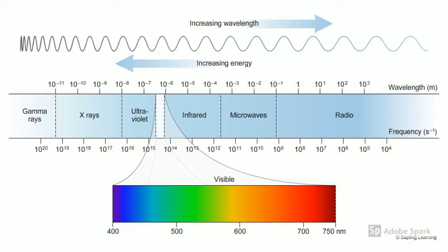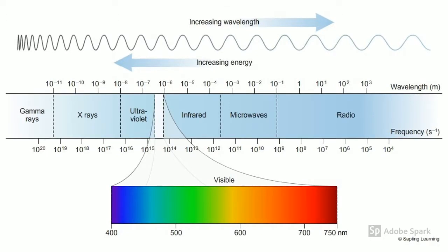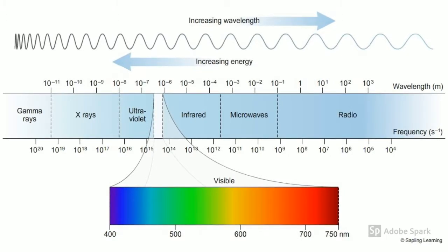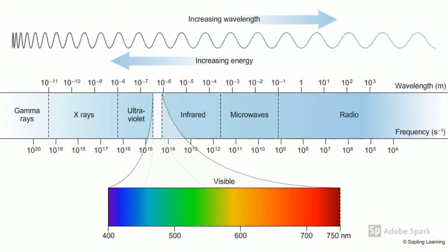A property that determines lambda max is the dye molecules. The observed color of a substance can be different than that of the actual dye molecules in the substance. In the glow stick lab, the green and red dyes had individual peaks and were observed to be the dye colors, red and green, whereas the mixture of red and green appeared to be yellow. However, the emission spectra displays two peaks, one that has a lambda max that correlates to red and one that correlates to green. Therefore, the lambda max is related to the dye molecules and not the observed color.